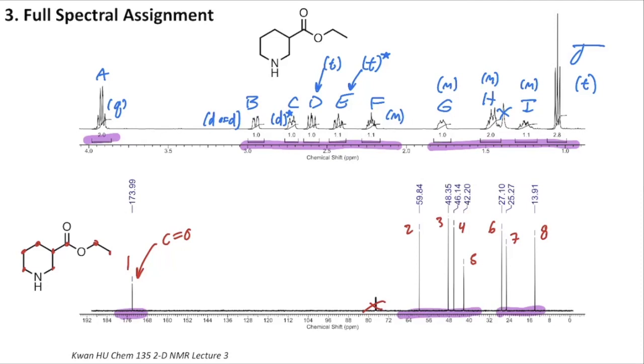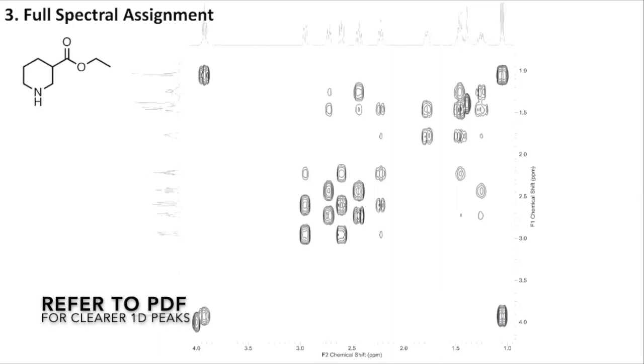Okay, I think we're ready to move on to the two-dimensional NMR data and take a look at that COSY. Take a quick break and maybe think up some assignments, then come back to it. All right, here's our COSY.